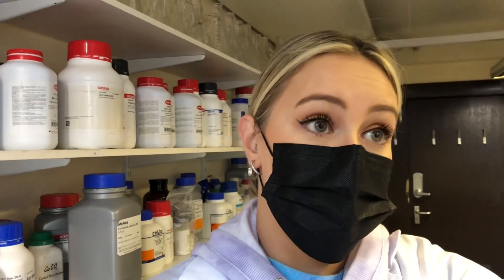Good morning — hopefully you can hear me because the sound in here isn't great. It's Tuesday, and I'm going to set up one of my plates because this week I'm testing the method I've developed for my assay with a known biocide. A biocide is basically something that kills living organisms; typically biocides are used in the marine environment as anti-fouling agents to prevent biofouling. Biocides could also be like fertilizers and things like that.